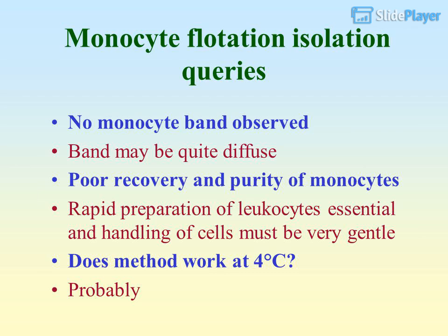Monocyte flotation isolation queries. No monocyte band observed. Band may be quite diffuse. Poor recovery and purity of monocytes. Rapid preparation of leukocytes is essential, and handling of cells must be very gentle. Does the method work at 4 degrees Celsius?